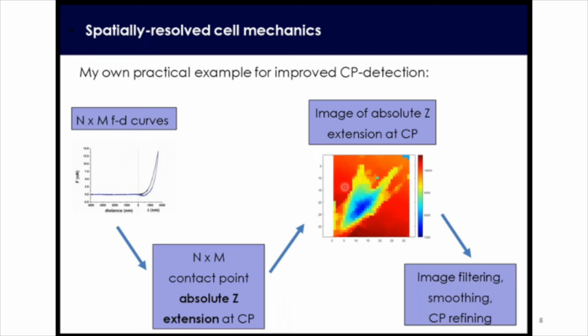And this means that since images are also examples of data being placed on a 2D grid, and the grid in real space on the cells is in a 2D region, the data gathered from AFM can be turned into an image. And this means that image processing and filtering techniques can be used on that data.